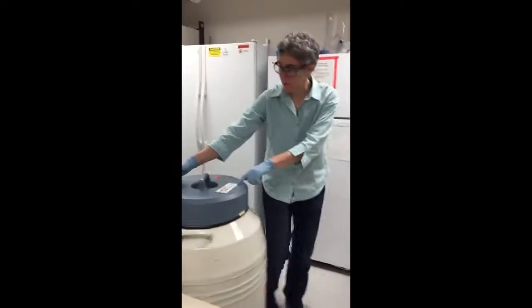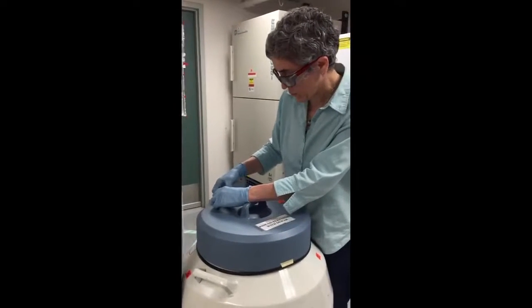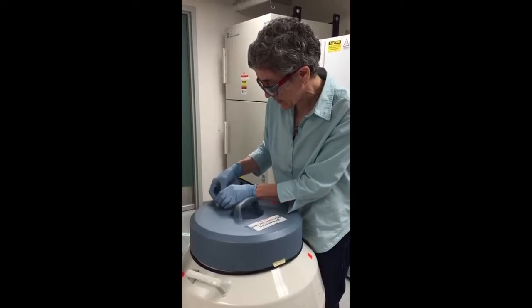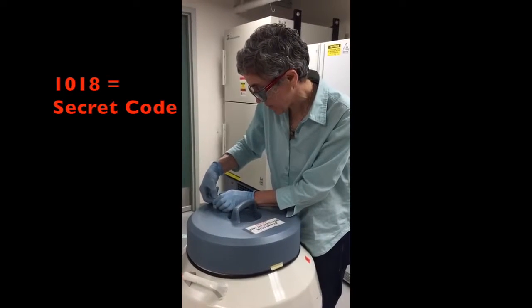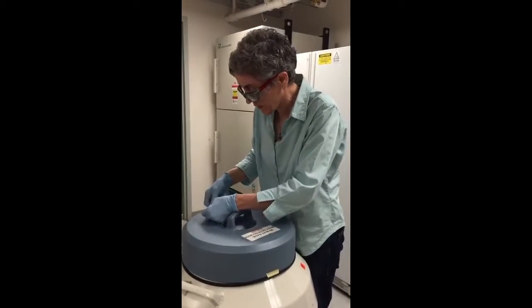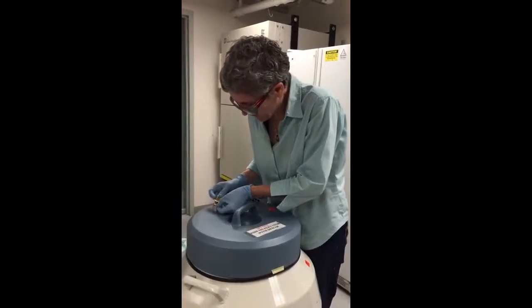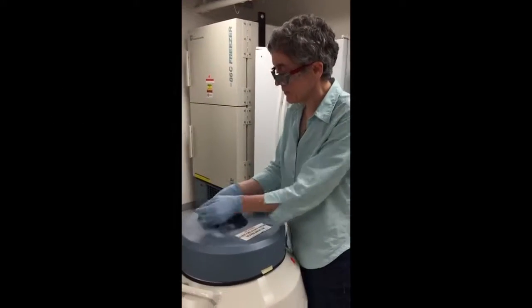Cells are in here. Here's our liquid nitrogen stock. The code on here is 1-0-1-8. It's also taped to the top door next to my bench if you don't want to have to look through this video. You might have to wiggle it around a little bit. And then it's 1-1-8. Open.